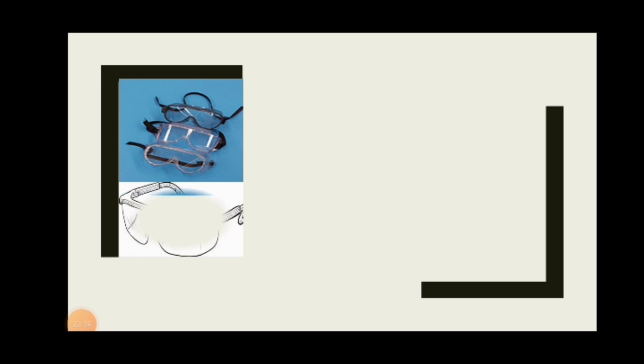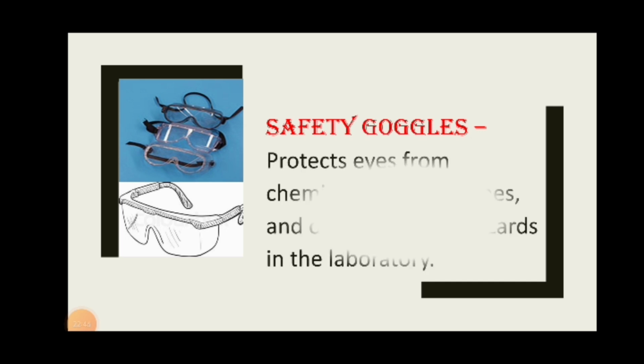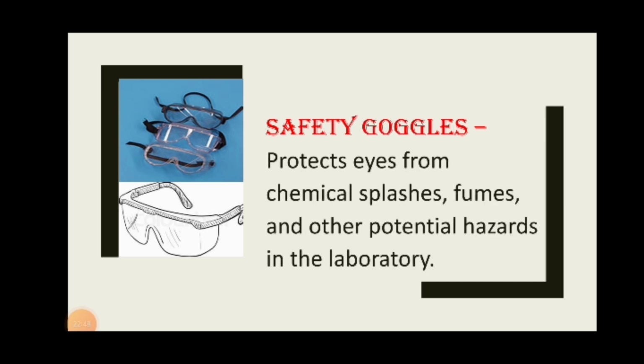Okay, next, yes, this is not an eyeglass for the laboratory activity. You have to use, yes, that's a safety goggles, no? So safety goggles is to protect eyes from chemical splashes, fumes, and other potential hazards in the laboratory. So others would use this maybe for fashion. No, that's not for fashion when using goggles. No, for your eye protection.